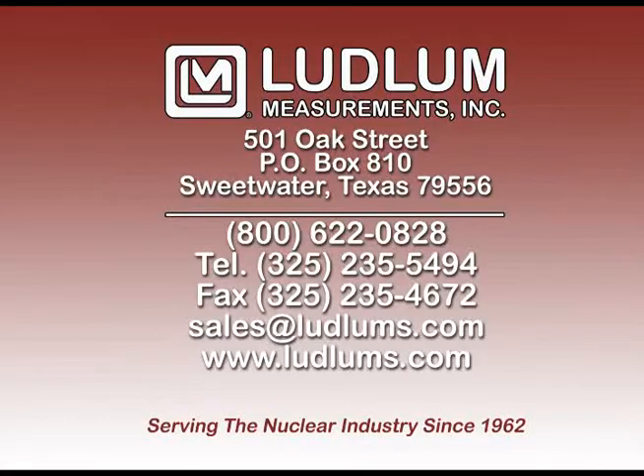Ludlum Measurements Incorporated has been manufacturing quality radiation equipment since 1962. Our objective is to provide a quality product that meets the needs of the user in a package that will withstand rugged use in harsh environments. To that end, the instruments demonstrated in this video were designed for durability to give many years of service with a minimum of maintenance.